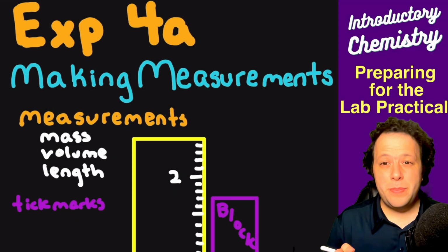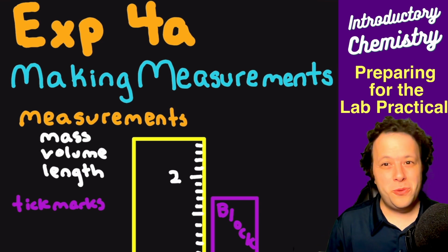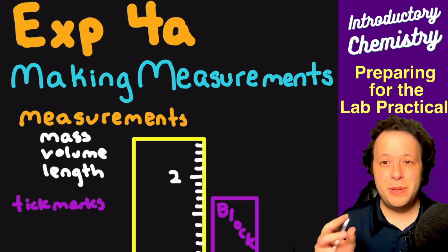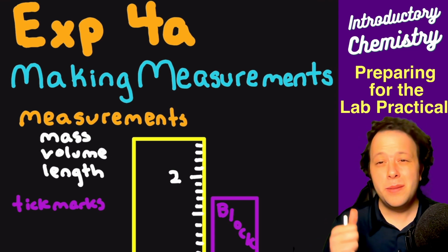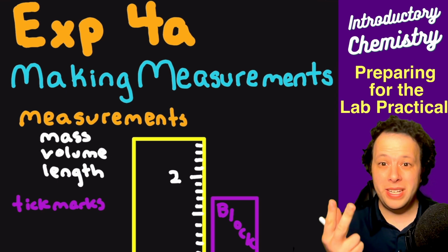The first experiment that you performed was making measurements back in week 1 or week 2 of your semester, a very long time ago. This lab went over some core concepts that were used throughout the entire semester. The biggest thing is you need to learn how to make different measurements of mass, volume, and length.